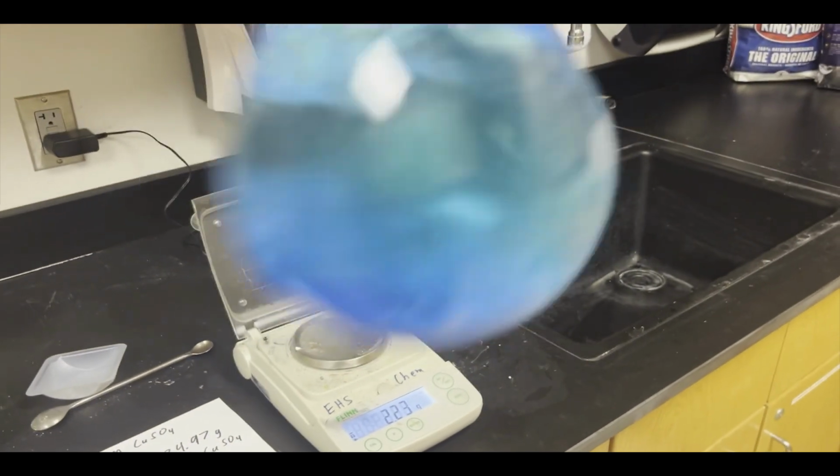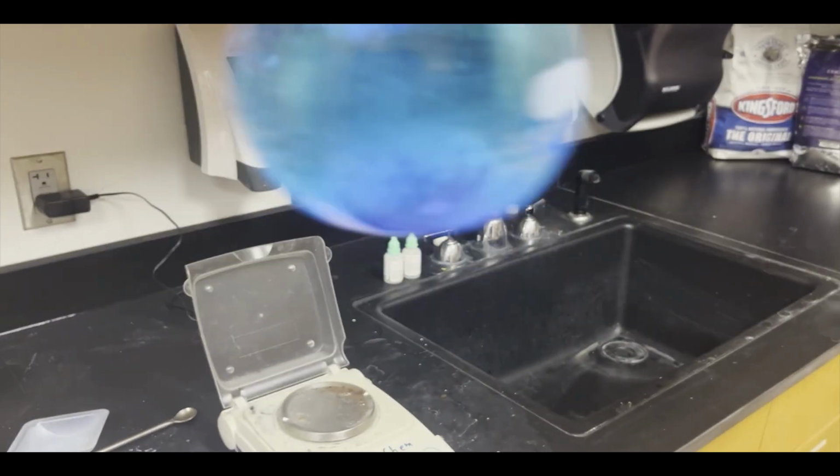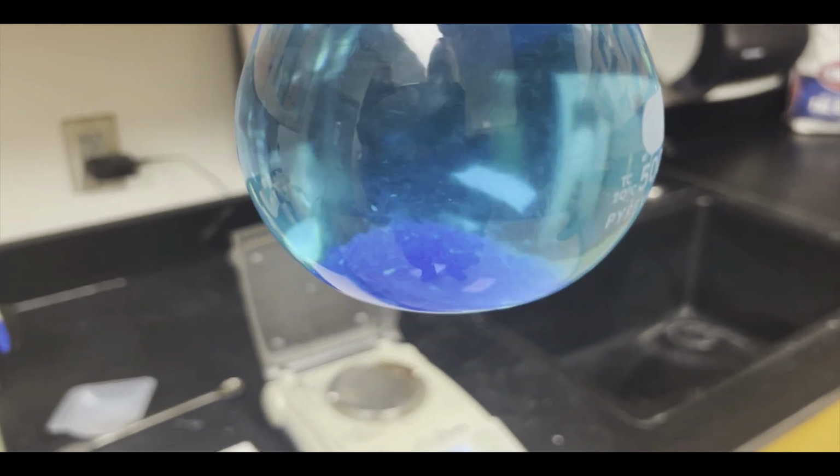And with swirling, I should be able to get this to dissolve, okay? It may take a little bit to do that, so we're going to swirl this together. And we'll continue to swirl until all of that copper sulfate on the bottom is dissolved into this liquid, okay?